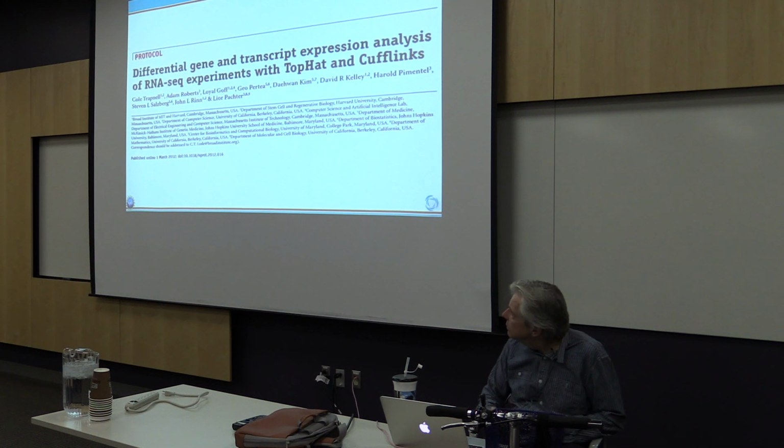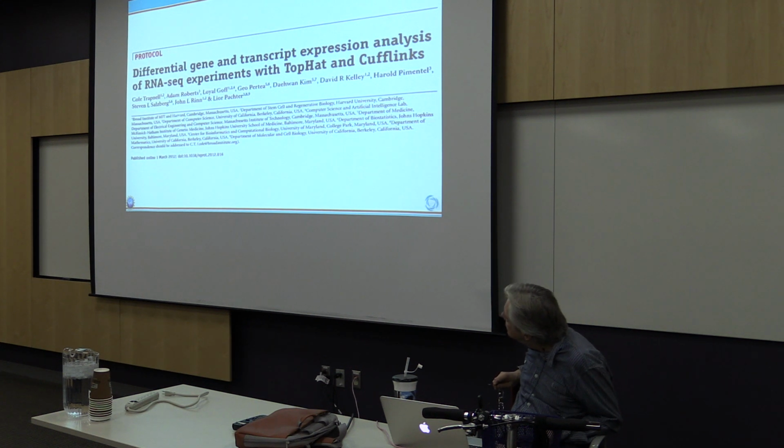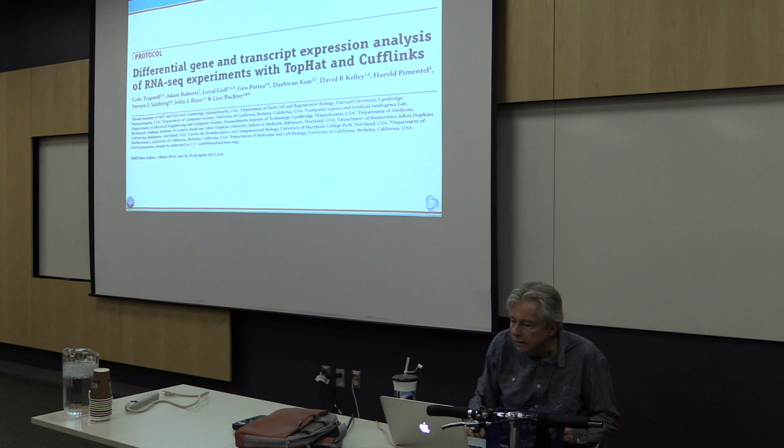And the main software we'll be discussing today is very commonly used, as I said. This is the paper published in relation to it, or one of the papers published. It's the Tuxedo workflow. You'll start out with TopHat, and then use Cufflinks for assembly.